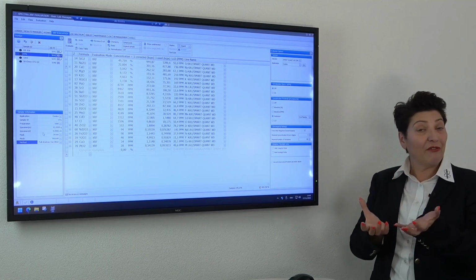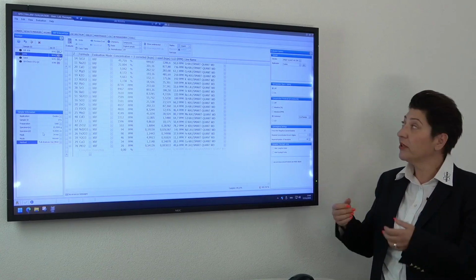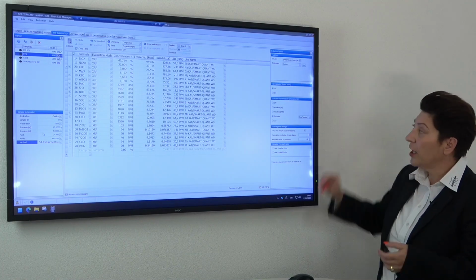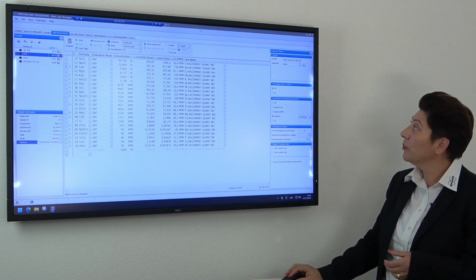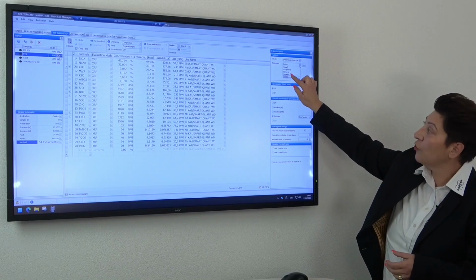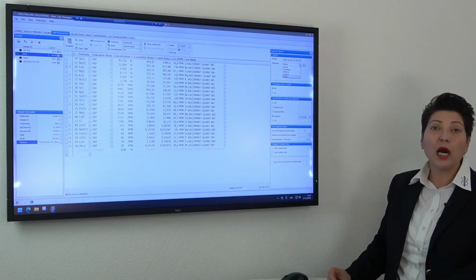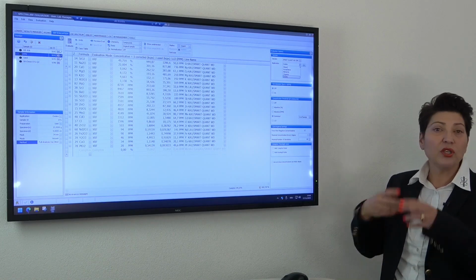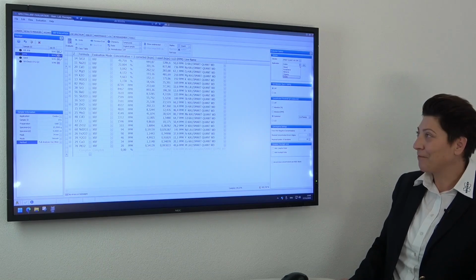If you have a proper model, which can be used for maybe several samples, you can easily create a new model here with a plus button. So then a new model will be saved. So here we have oxides. We also have some other models already predefined, like elements or for organic samples, where a carbon matrix is already selected. So here you can do some optimization on the evaluation of the standardless sample.